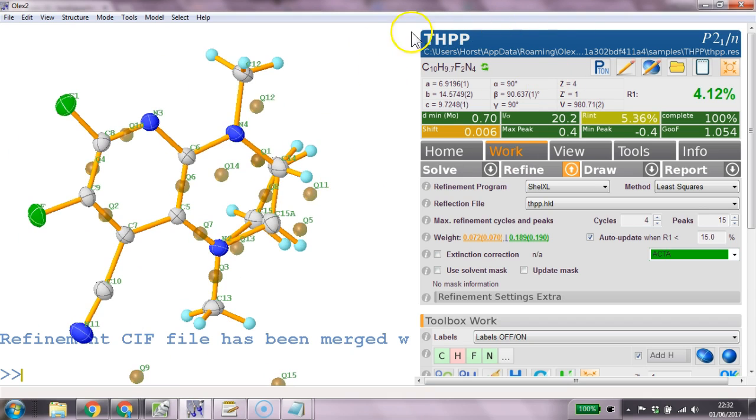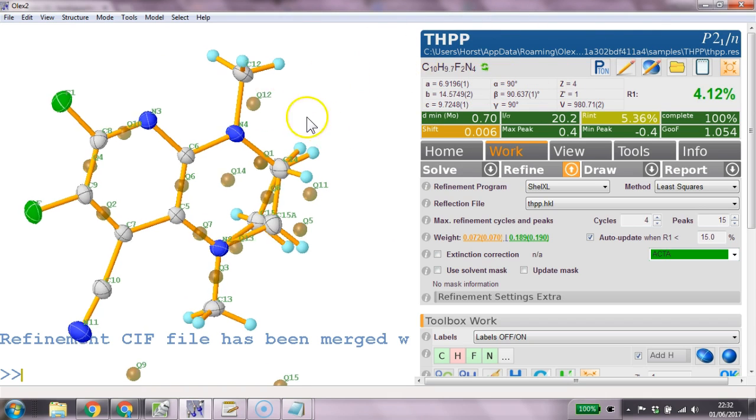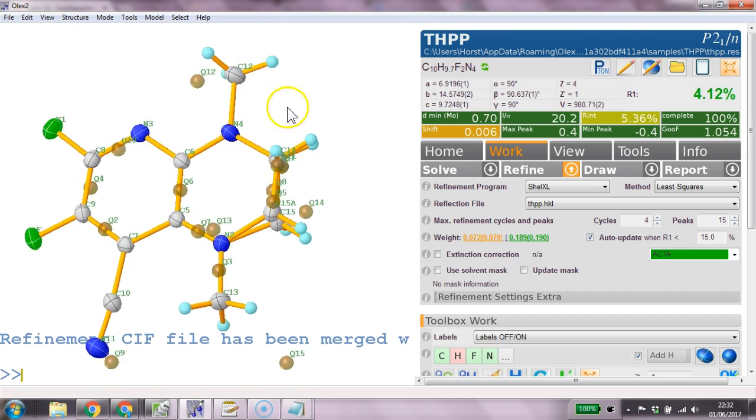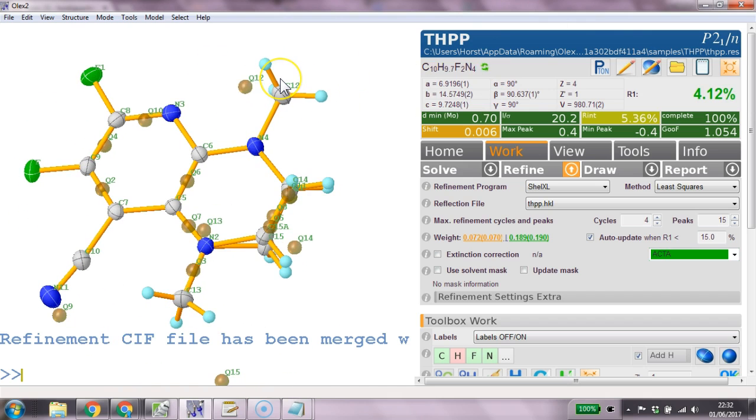The display up here shows me that the isometric unit doesn't actually correspond to what's on the screen. But I think in this structure it's actually a rounding thing. The command for this would be fix unit.